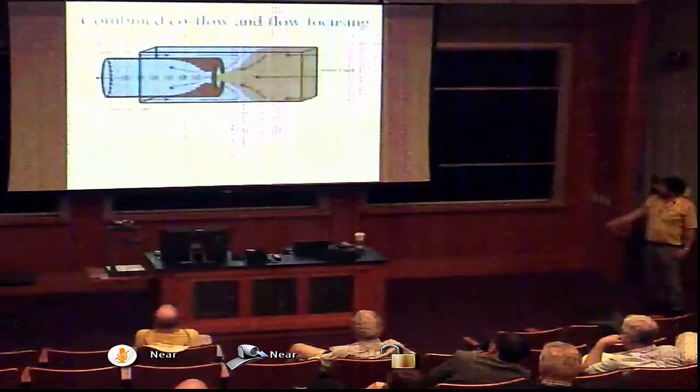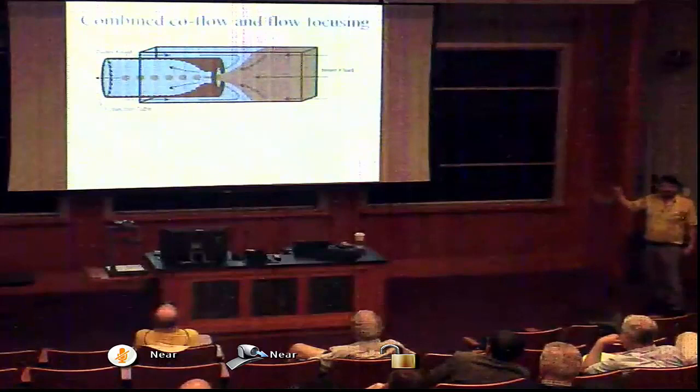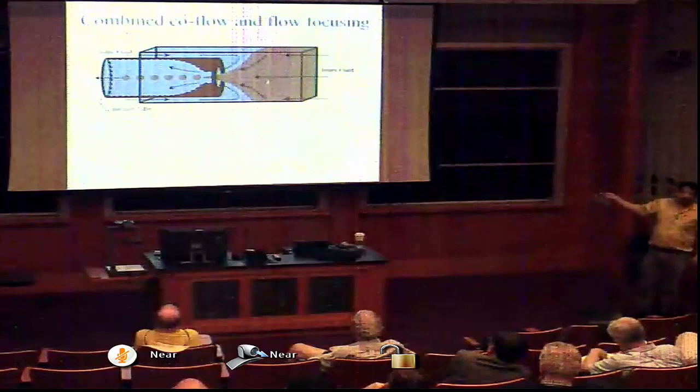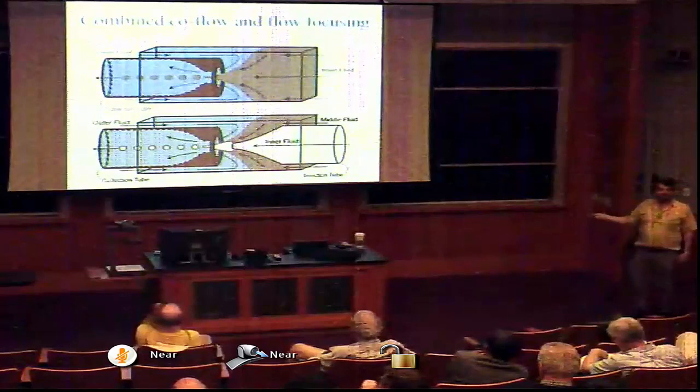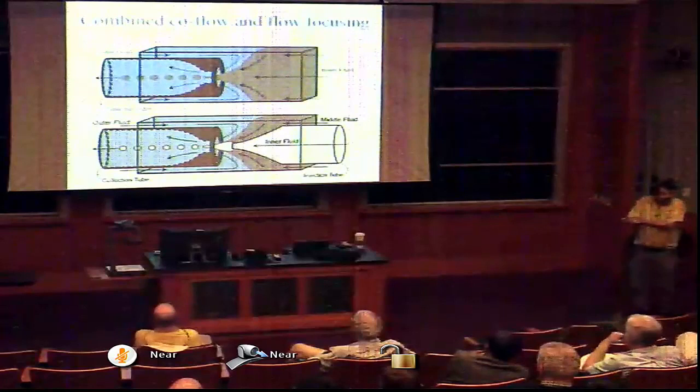But what's really interesting is we have this flow focusing geometry, but look, remember I told you we can align things really well. We have a lot of space here. Let's just put another capillary tube. Now we have a flow focusing, but not of a single fluid, but a coaxial flow of two fluids. So now we have three fluids, surrounding fluid from the innermost fluid, all in this outermost fluid. It works, it's very easy to assemble.